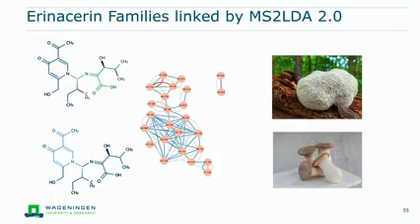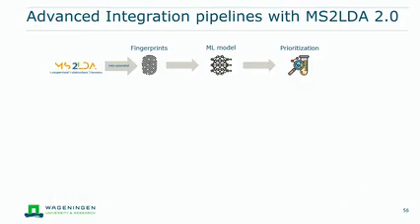One thing that is a little bit closer to my heart is to use MS2LDA for pesticides. And there I will talk also about a feature I didn't mention yet, because this is only if you use it in a notebook, for example, and it's currently not available in the visualization app. So what MS2LDA does is it generates all those Mass2Motifs, right? So you have a bunch of structure recommendations. And one thing structures can be represented with are chemical fingerprints. If you are familiar with cheminformatics or not, a fingerprint is a often binary representation of whether certain structural features are present in a molecule or not.